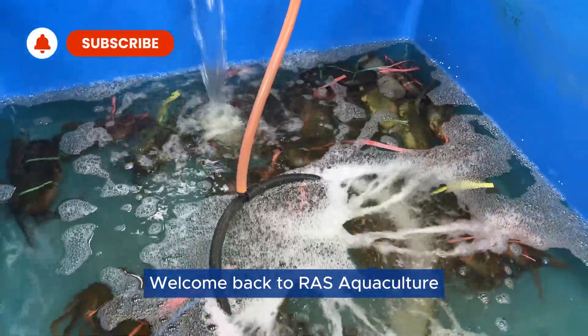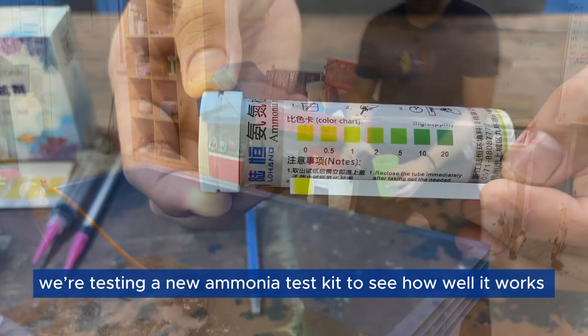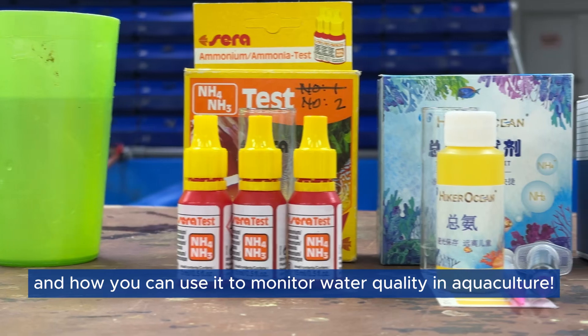Welcome back to RAS Aquaculture. Today, we're testing a new ammonia test kit to see how well it works and how you can use it to monitor water quality in aquaculture.